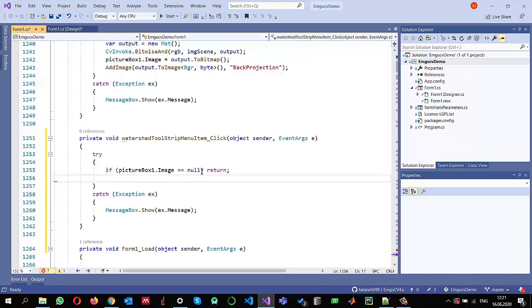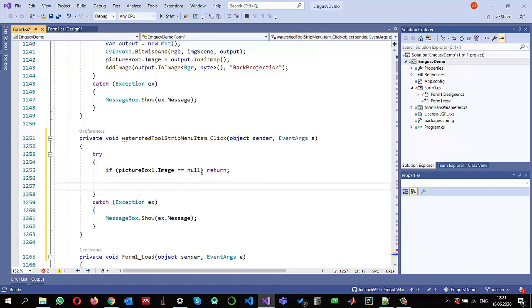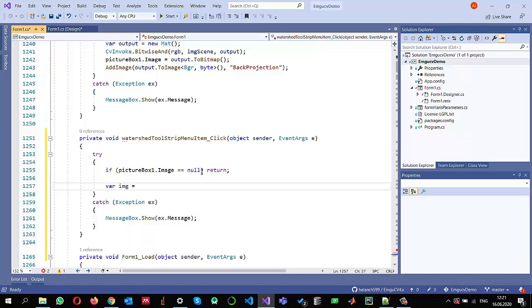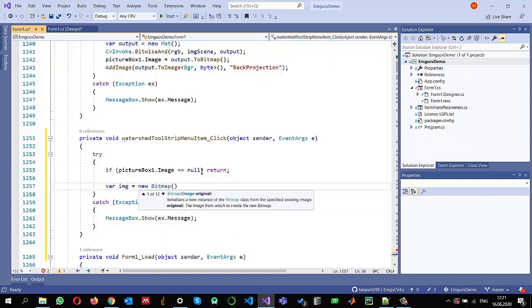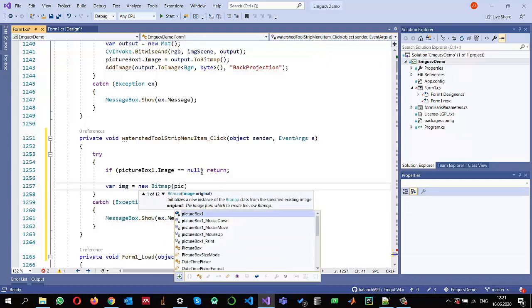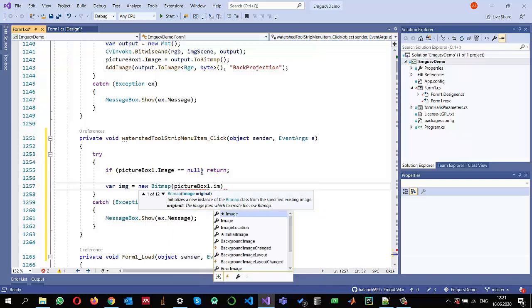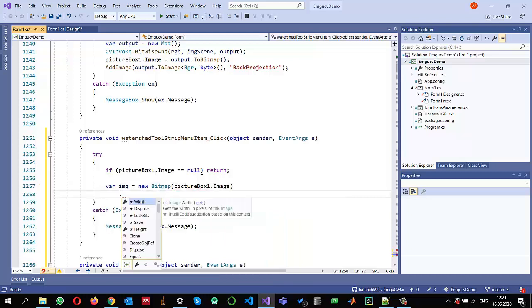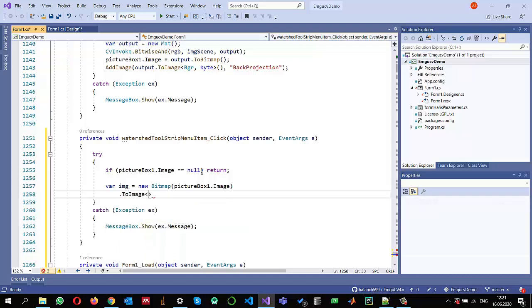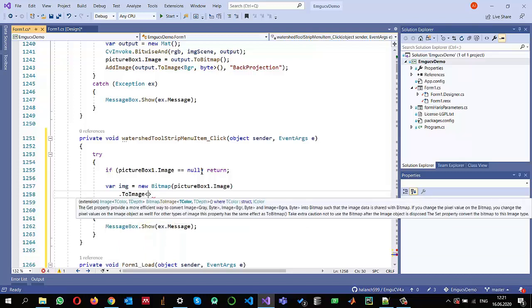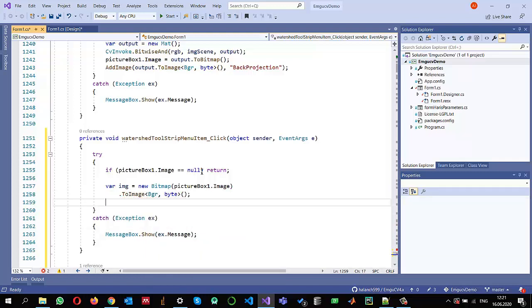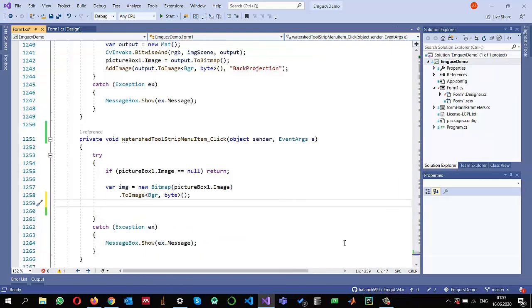Once we make sure there is an image, I can read it into a variable called `img`. I will create a new Bitmap object passing in `pictureBox1.Image`. Since I need an EMGU CV structure, I can use `ToImage` to convert it into an EMGU CV BGR image with depth in bytes.